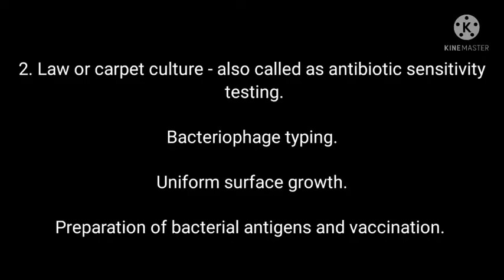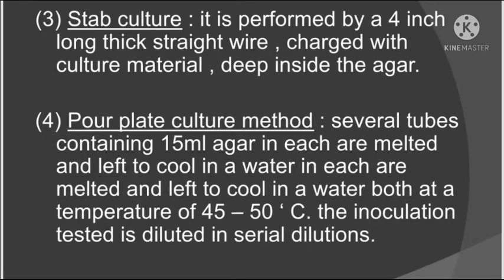Lawn or carpet culture is used for antibiotic sensitivity testing and bacteriophage typing. It gives uniform surface growth and is used for the preparation of bacterial antigens and vaccines. Stab culture is performed with a 4-inch long thick straight wire charged with culture material, inserted deep inside the agar.